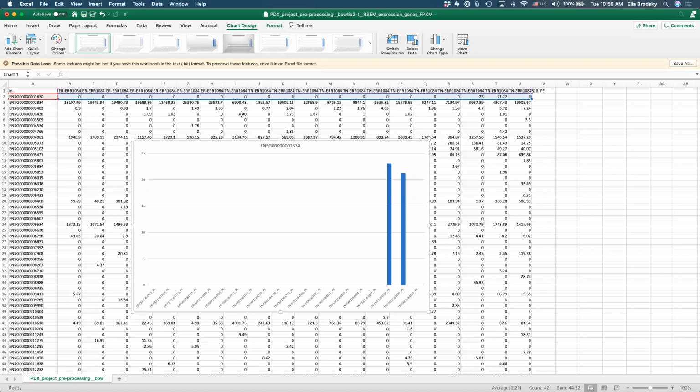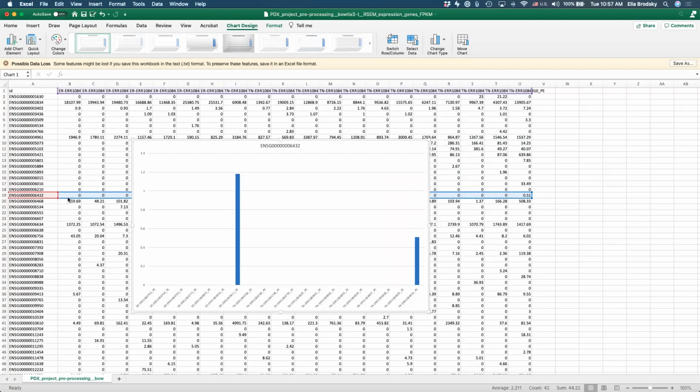Okay, so to look at this gene, in triple negative samples, you can see TN for triple negative and ER for ER positive. So for triple negative, a couple of samples have an expression over 20. Let's take a look at another example. Okay, in this example, you have ER, so 1 sample from ER, 1 sample from triple negative. But how high is the expression, right? The scale here changed. So instead of 20, this is 1.2, and this is below 0.6.